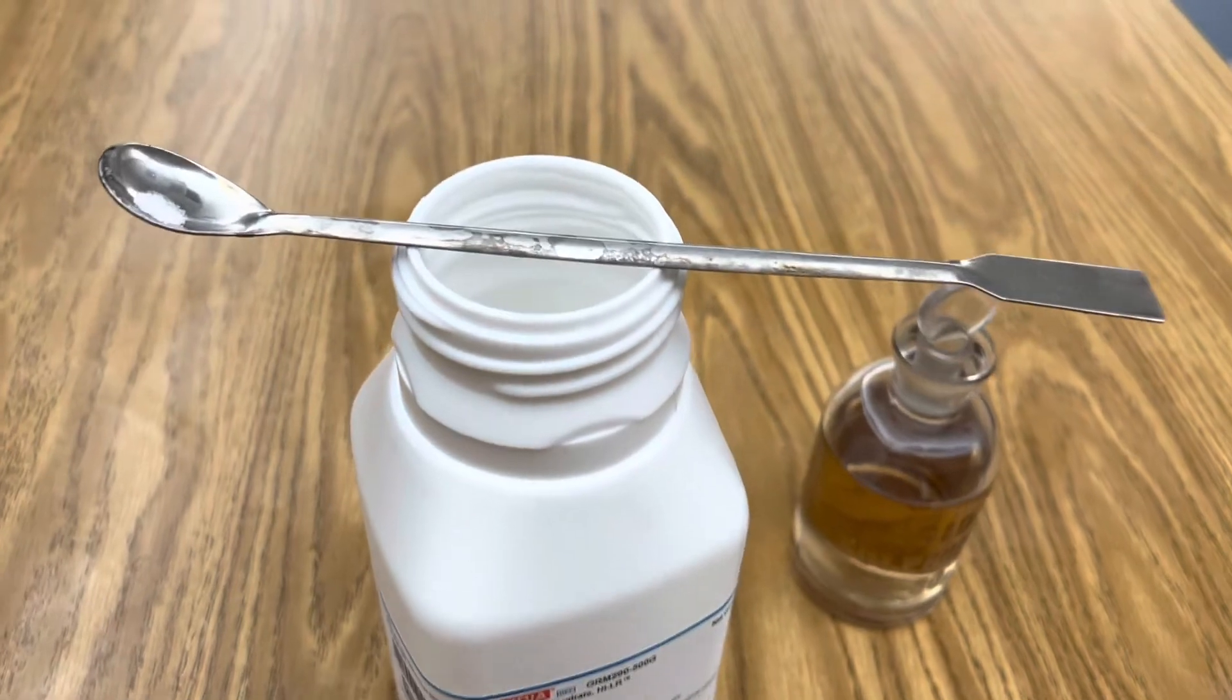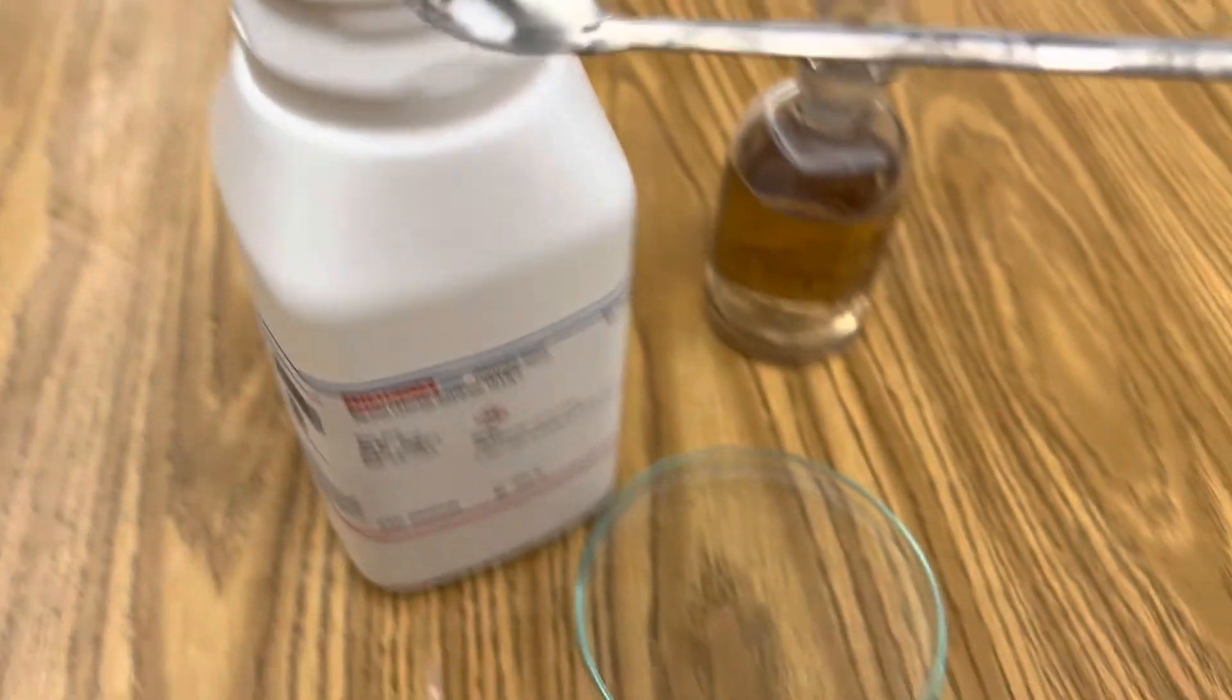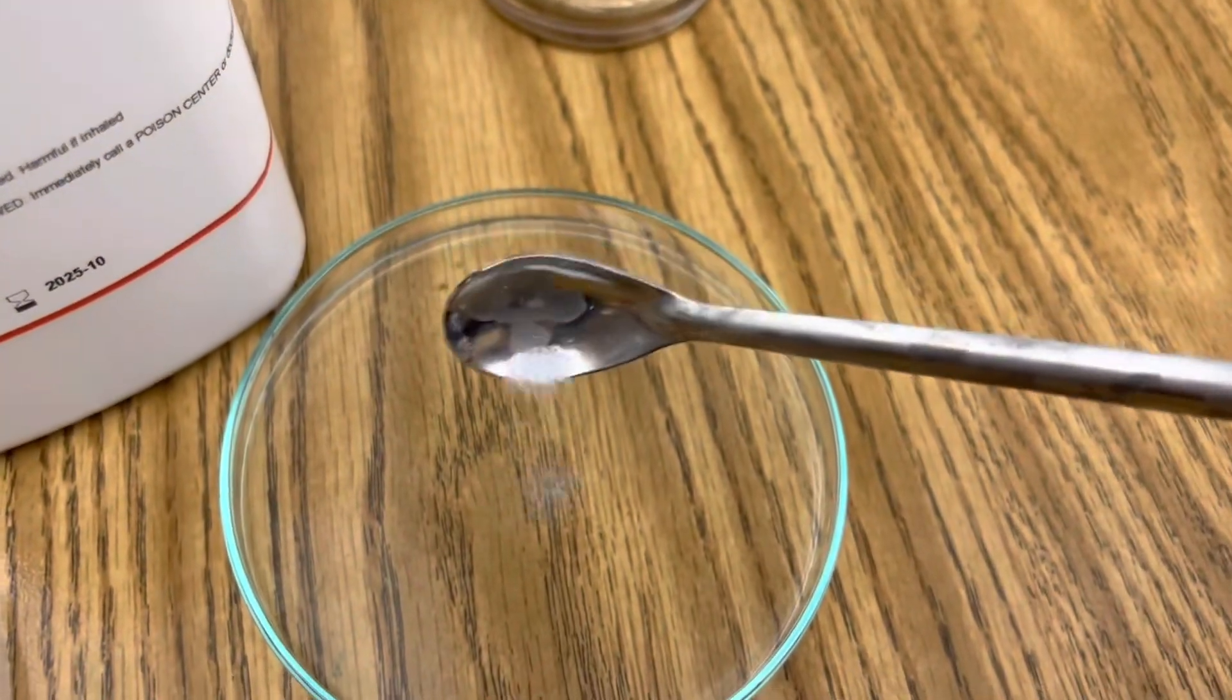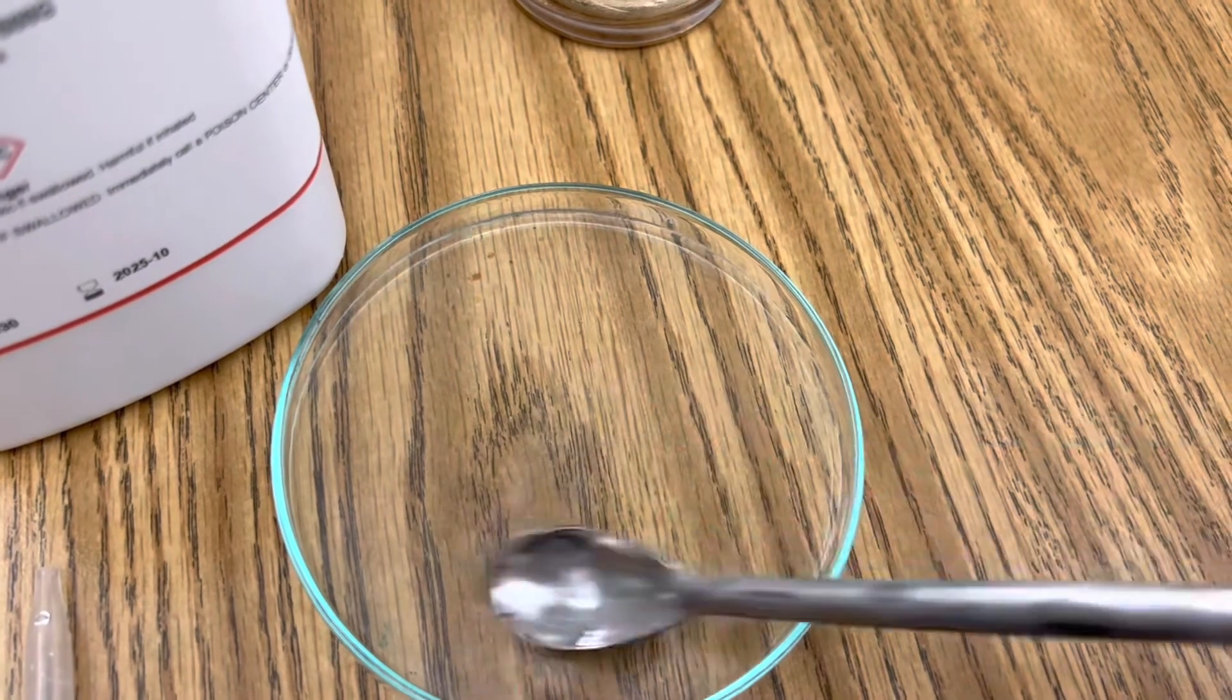To begin, I'm going to create an aqueous solution of barium chloride by just adding one or two grams of barium chloride to my petri dish. I'm going to stir it around until it completely dissolves.